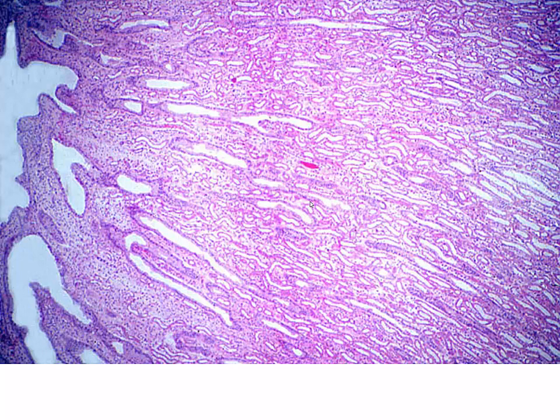Now, as we look at this image, all of these longitudinal sections, we are looking at our collecting ducts as they're moving into our larger diameter papillary ducts, and we can actually see a papillae. We're getting into our area cribrosa here at the very end. So much of what we're looking at here are going to be our collecting ducts streaming in, and you see how they coalesce together into these very, very large ducts of Bellini or papillary ducts, and they coalesce together until they empty into this space that's occupied as one of our calyces.